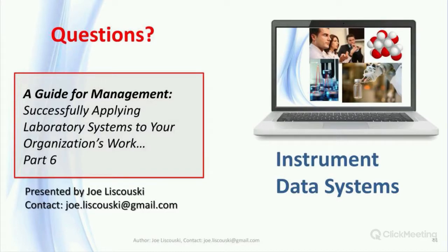And another question that came in was, why can't we just use our IT people to troubleshoot our systems? Okay, the basic issue is that most IT people don't have the background needed to understand how the systems, and that includes the computers and the instruments, work together. They don't understand the need, for example, for looking at the data to help isolate problems. They'll do routine maintenance on computers. That's within the scope of their work.